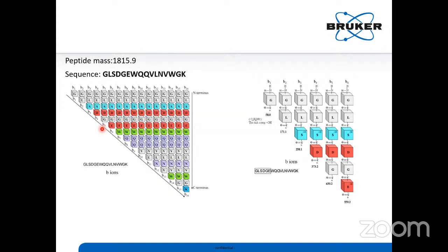Then you will connect each peptide. So you will confirm your protein sequence. So intact level is direct protein sequence. Peptide level means only MS level peptides. Amino acid frequency level, sequence level means MS fragmentation level.